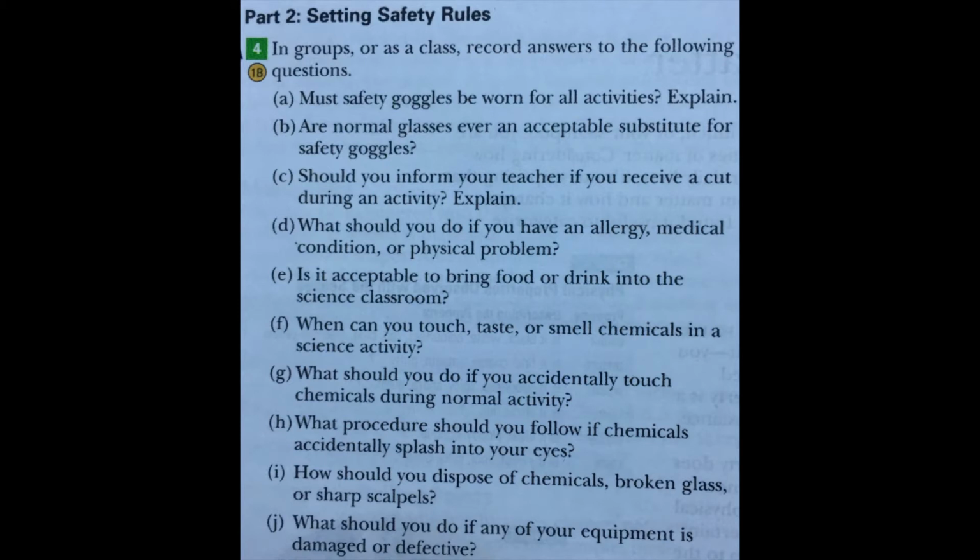You dispose of chemicals according to the pre-lab instructions. It may change each lab. Make sure that you understand where to put them before you even touch a chemical. You never put chemicals back into the original container.